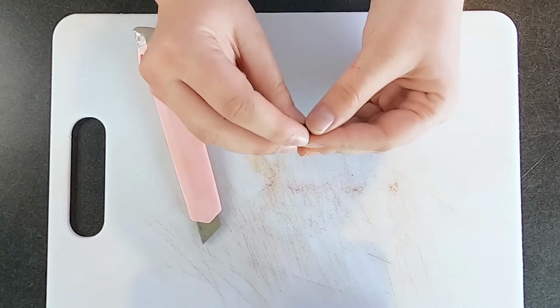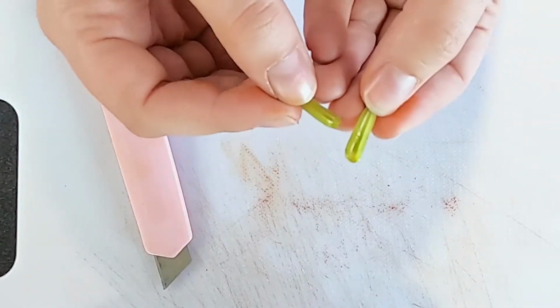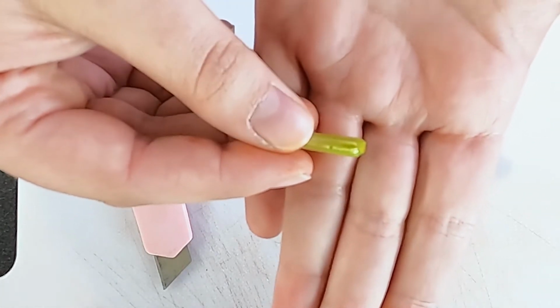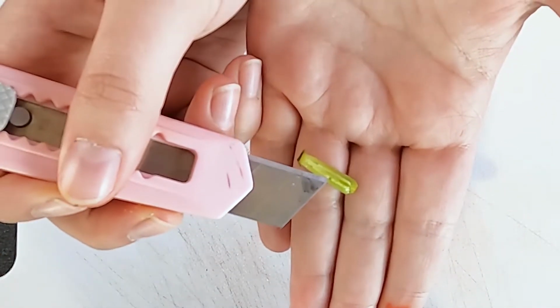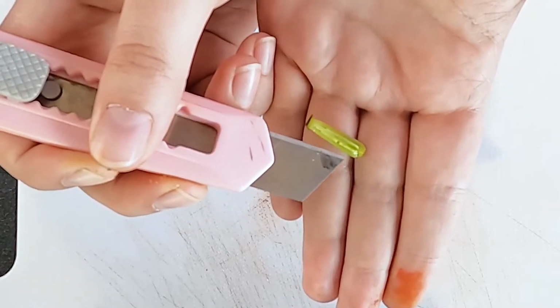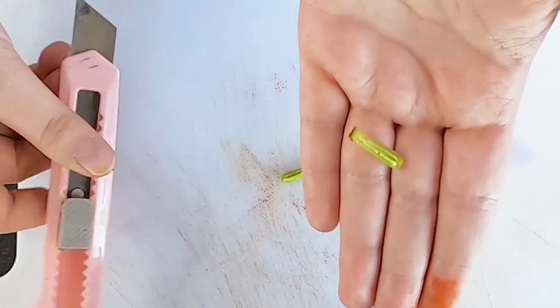Sometimes it might be a little bit hard to see. So you can kind of see here, there's some tiny little dots in there. There's a big row of them. You can see, I'll point out right here. You can see these are all the eggs, and these are called ovules when they're unfertilized, and then they will eventually become seeds once they are fertilized.